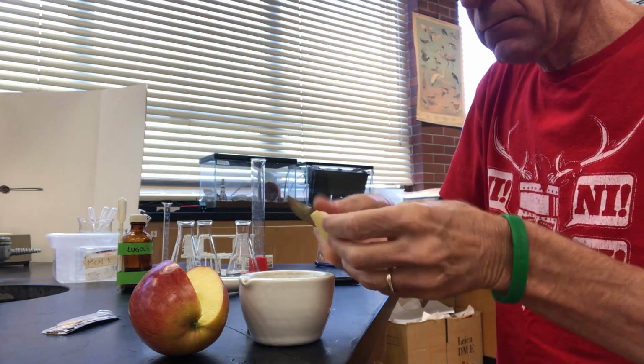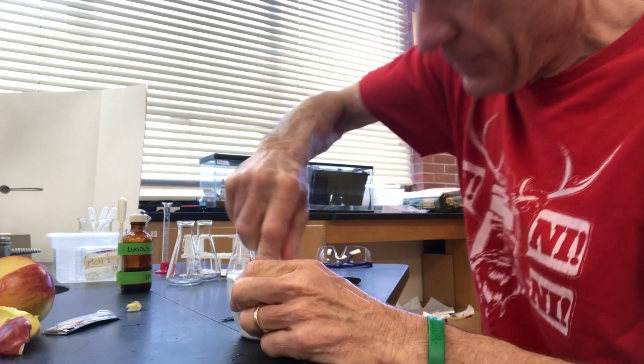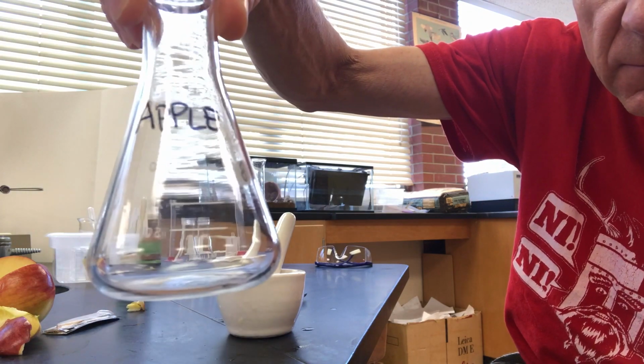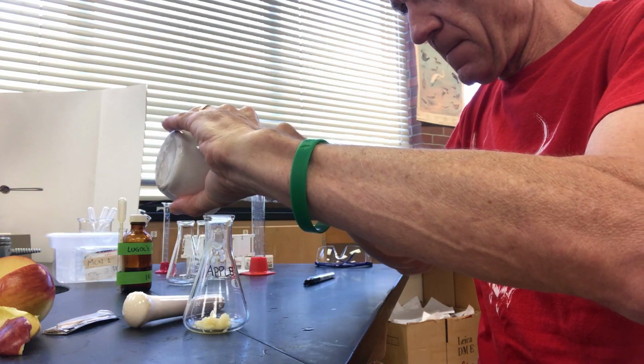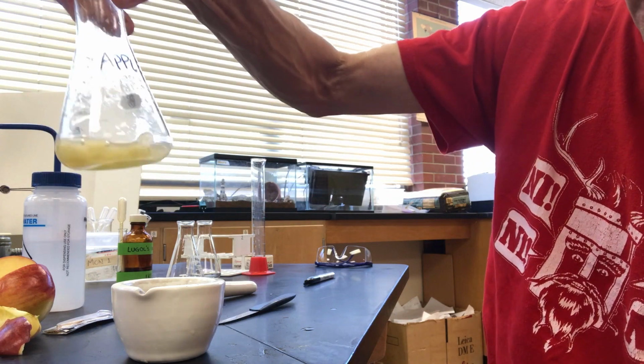Start by cutting a small piece and cutting that into smaller pieces and putting them into the mortar. With the pestle, grind the apple until it's a pulpy mush. Then label an Erlenmeyer flask and add the mashed apple. To that, add 10 milliliters of water and swirl to mix.